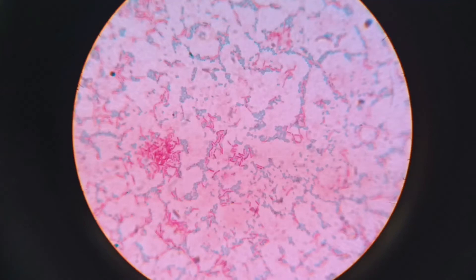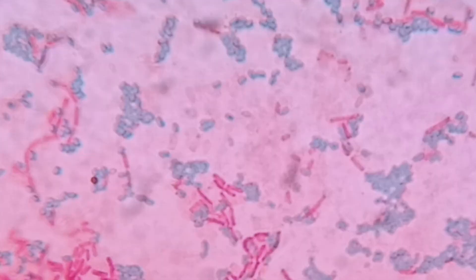The bacteria will look pinkish or reddish in color while the endospore will look greenish in color. Now let's visualize it clearly. In this figure, you see that bacteria are rod-shaped, pinkish in color, while the endospores are oval in shape and forming bunch of endospores.